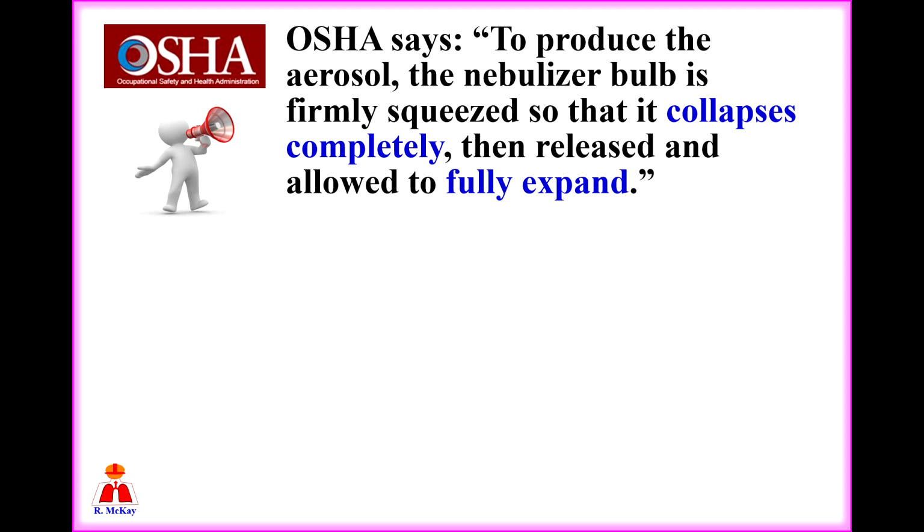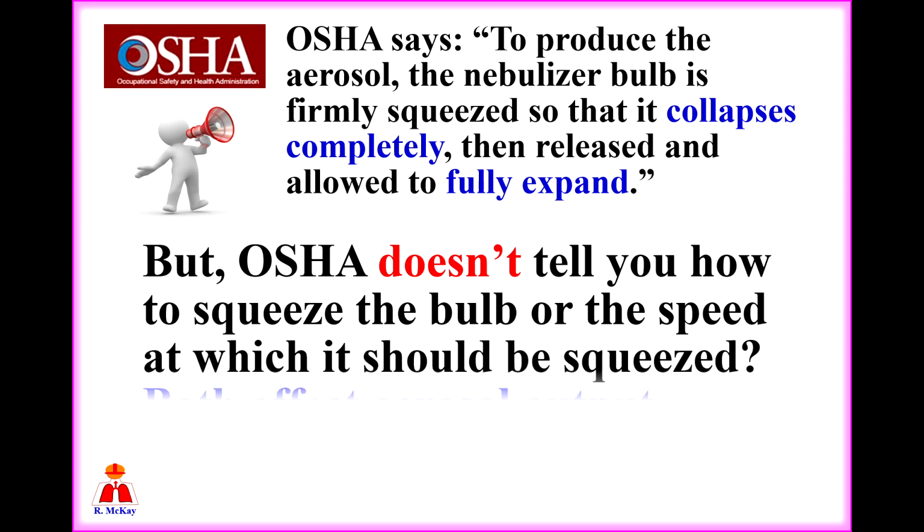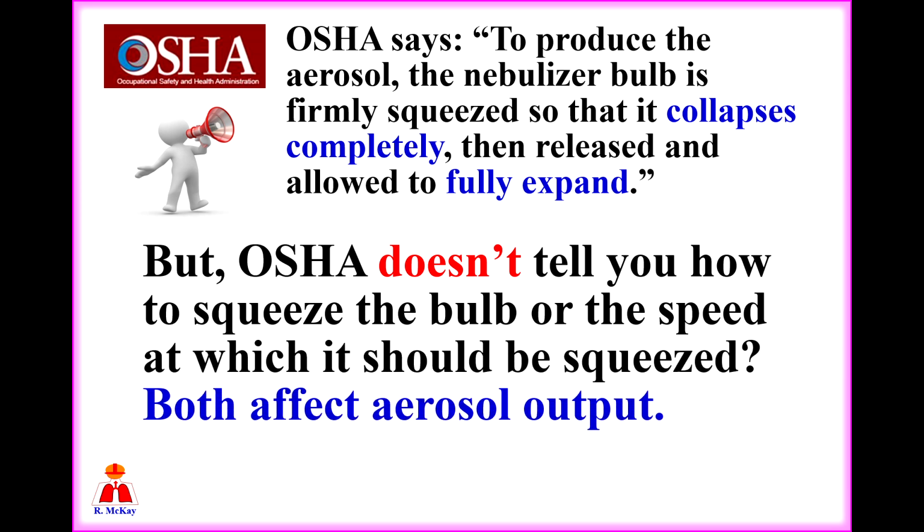OSHA says to produce the aerosol, the nebulizer bulb is firmly squeezed so that it collapses completely, then released and allowed to fully expand. But OSHA doesn't tell you how to squeeze the bulb or the speed at which it should be squeezed. Both of these affect aerosol output.